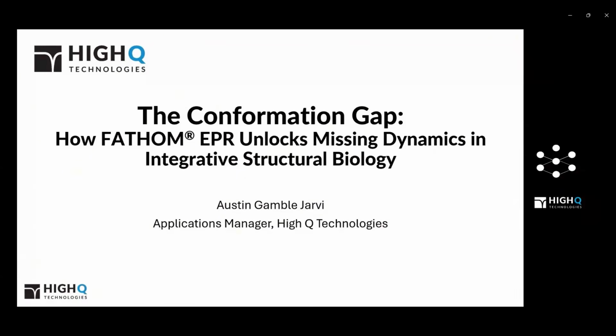Today I'm going to be talking about a general introduction to EPR as it relates to structural biology. I'm going to talk about a little bit of background and a very light dose of theory on EPR so you can understand what it is, how it works, and what kind of information we get out of it. Then I'm going to go through some selected examples from literature to show how EPR can be used in conjunction with common structural biology techniques to give you a fuller, richer understanding of protein and biomolecule dynamics and the full picture of what it's doing. So let's go ahead and get started.